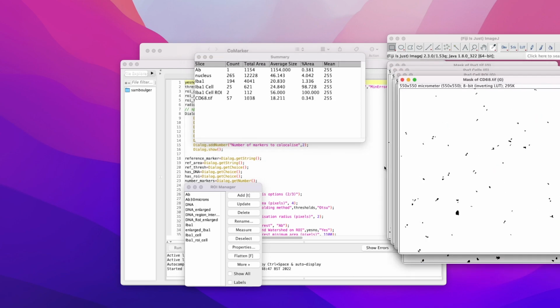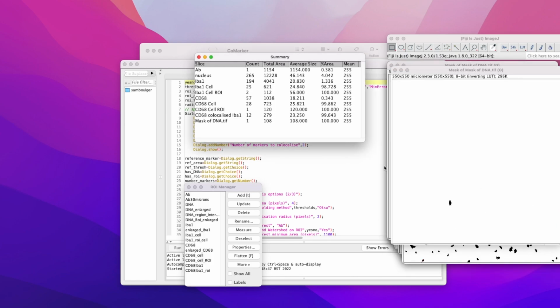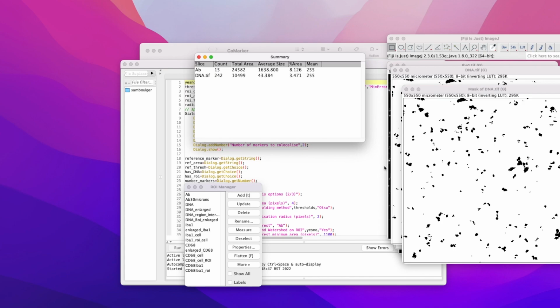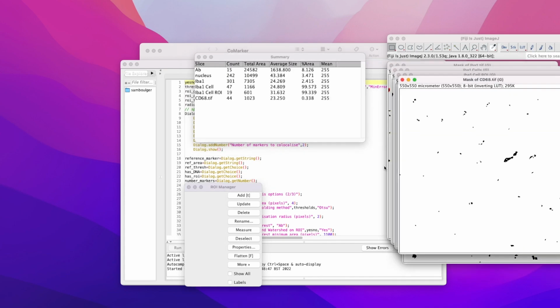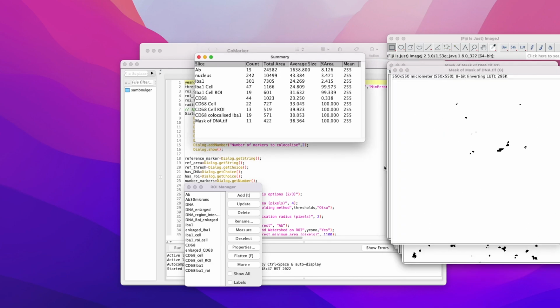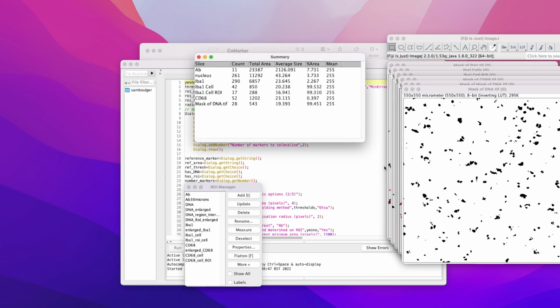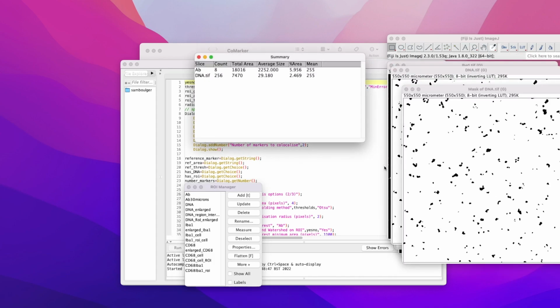In the sample run, we have used CD68, a microglial activation marker, as our general colocalisation marker. The data we get about this marker is the same as that we get about the reference marker. However, we also analyse the colocalisation of this marker with the reference marker, both with and without respect to the region of interest. It is very useful to have a read of our manual, which you can find online.